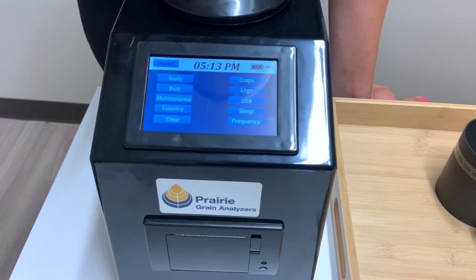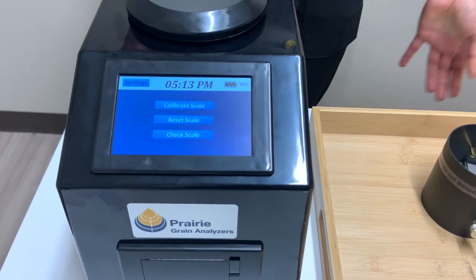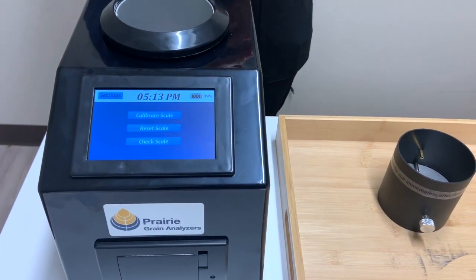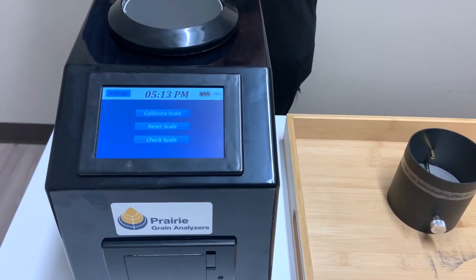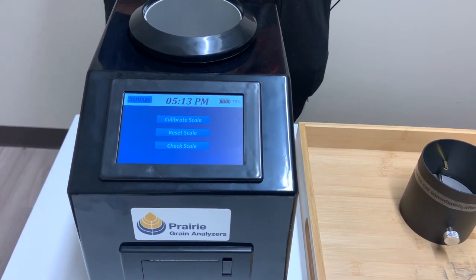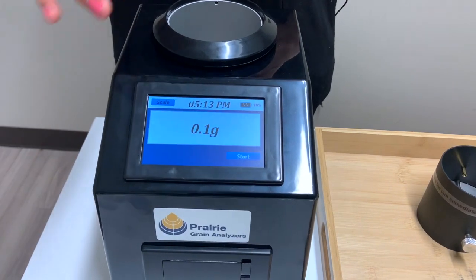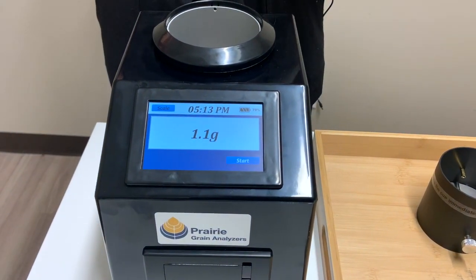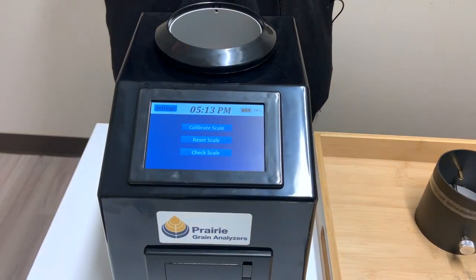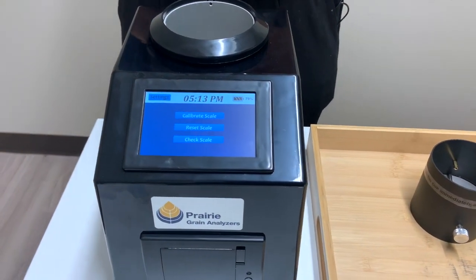Now let's go back into the settings and look at the scale setting. When you get your tester, because it's being shipped and can get thrown around, you want to make sure you check the scale to see if it's working properly. We recommend during harvest that you check the scale before you start your day to make sure you get correct and accurate readings. Go into 'check scale' and it will show you what the scale is reading. Within one gram is normal, but if you see anything more than that you'll want to calibrate the scale, which is in the same settings.